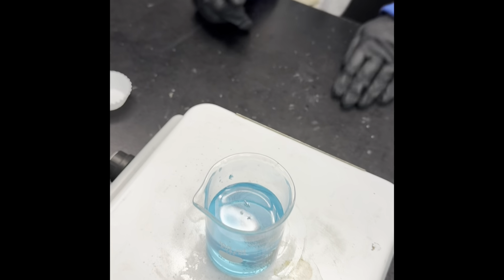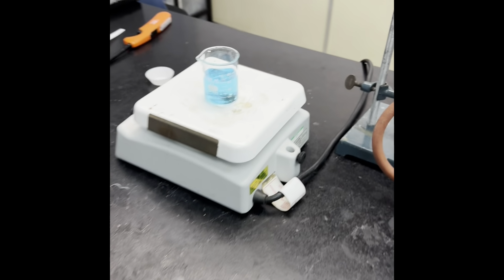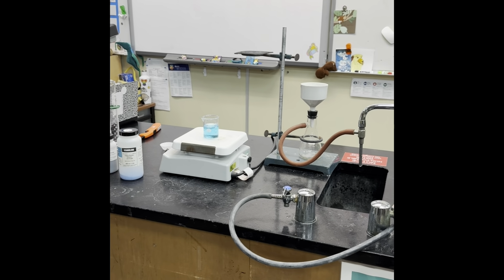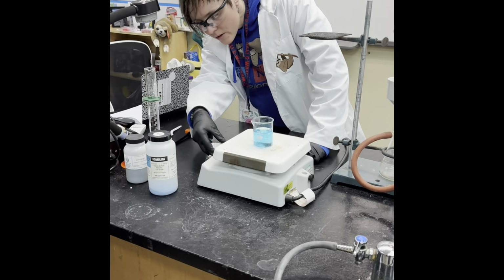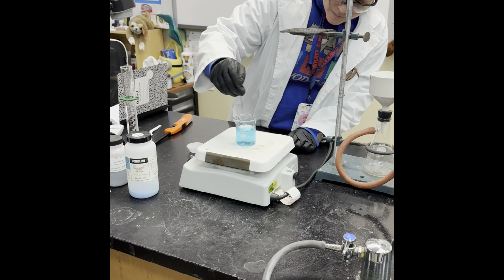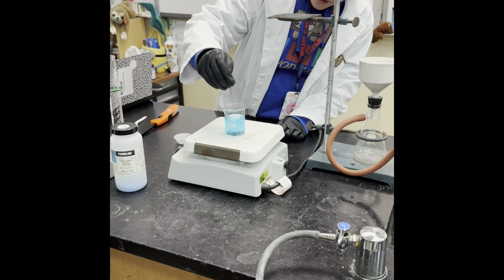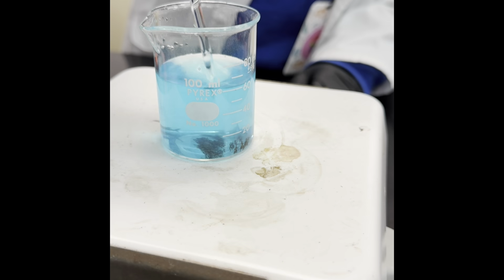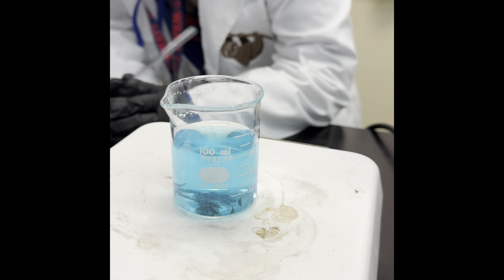Okay, I will get a glass stir rod. You can take a look at that, because I can stir it. And the glass stir rod's easy to clean. So this reaction doesn't take a super long time. Normally, I have, and my TAs have tested, all different sources of iron, and it seems like the powder tends to work the best.